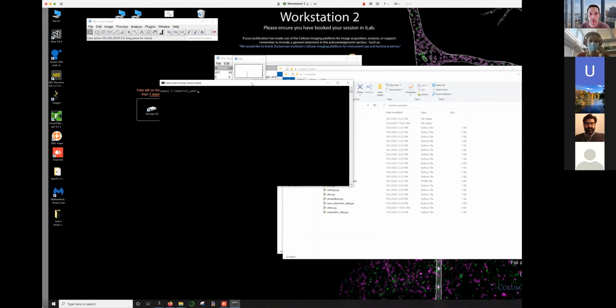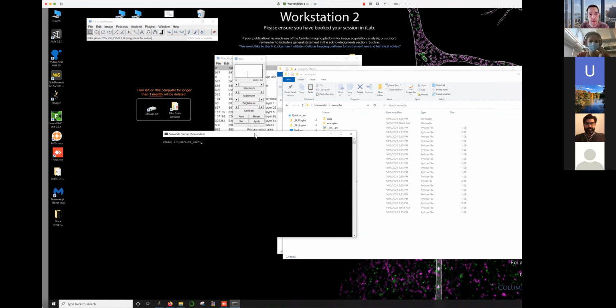Whenever you're working with these tools, it's a good idea to create an environment for them. The environment is just a separate instance where you can install a specific version of Python. That way, you're not installing it amongst other things you've downloaded that could break it or make something else not work. So making a separate environment is a really good way to make sure that things will actually work. They don't give you an environment file like in the case with ClearMap, but it's actually a little bit simpler to install.